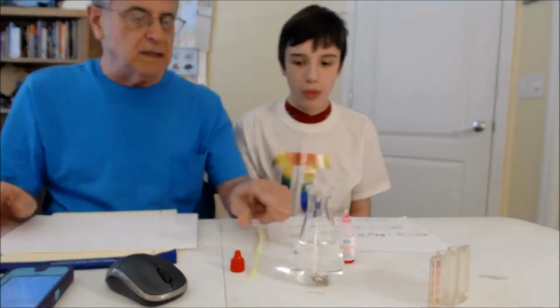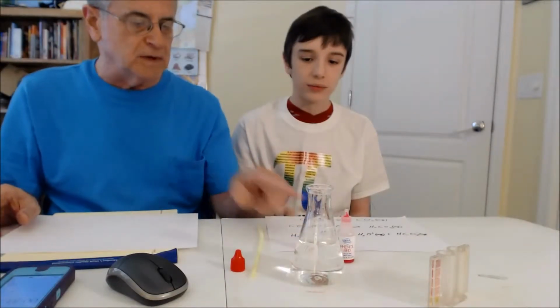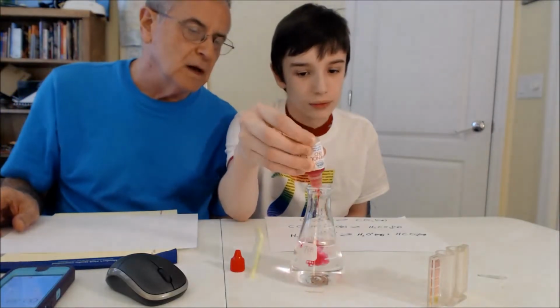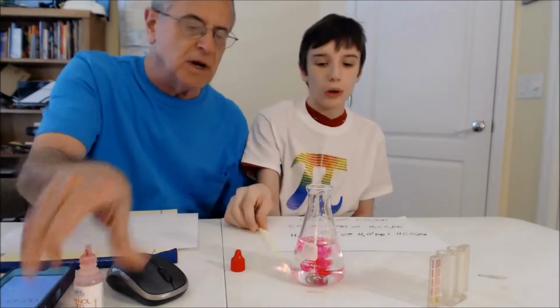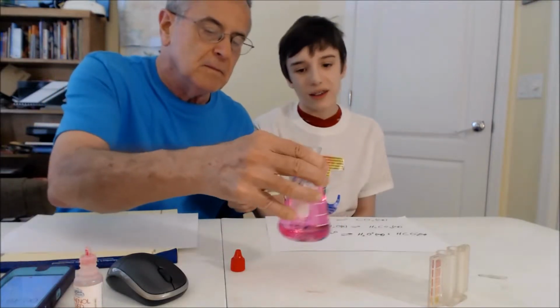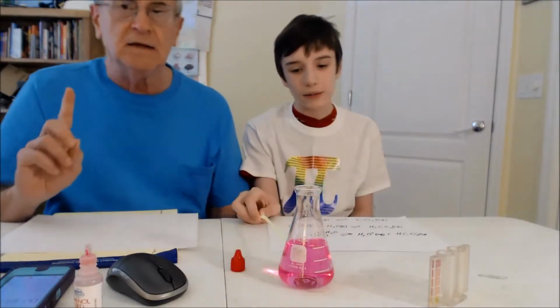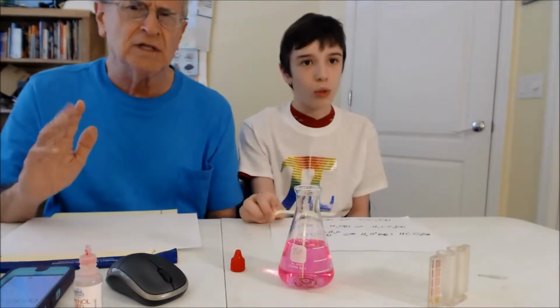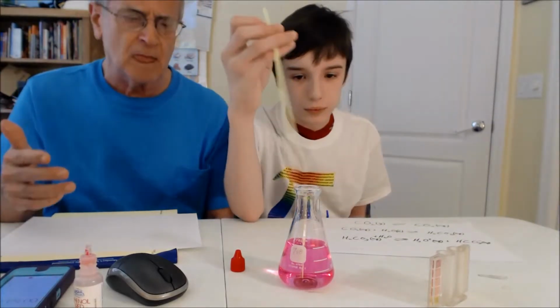So, Pi Guy, let's take some tap water here and put some of that indicator in, see what the pH of tap water is. As you all can see, what color is it, Pi Guy? It is pink. Pink, indicating that it's a basic solution. Now, it's not real basic. It's only slightly basic, maybe pH 8 or 9.